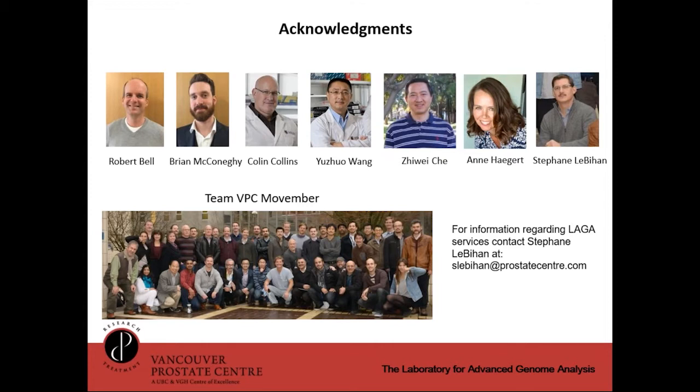And I'm just trying to think if we used a pooled reference. I don't think we did for our last Oncomine targeted panel, but I don't see why not. I think that adjustable binning should answer that question.